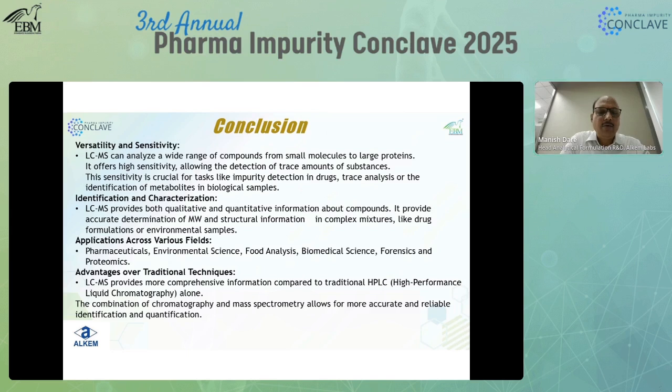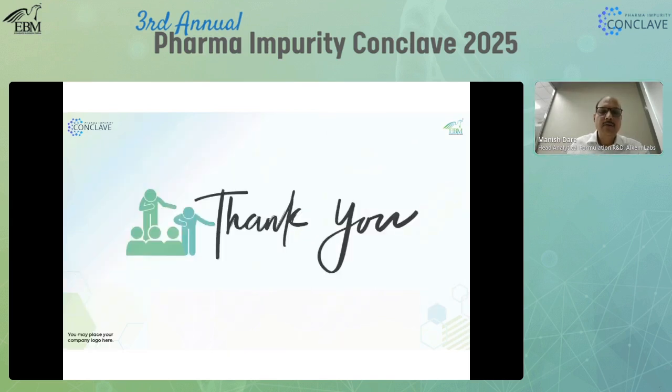And the mass spectrometer is nowadays available in most quality control labs, and they are going to get the information much faster, predicting the structure and arranging the impurity and completing their hypothesis investigation, instead of taking more time. So that's all from my side.